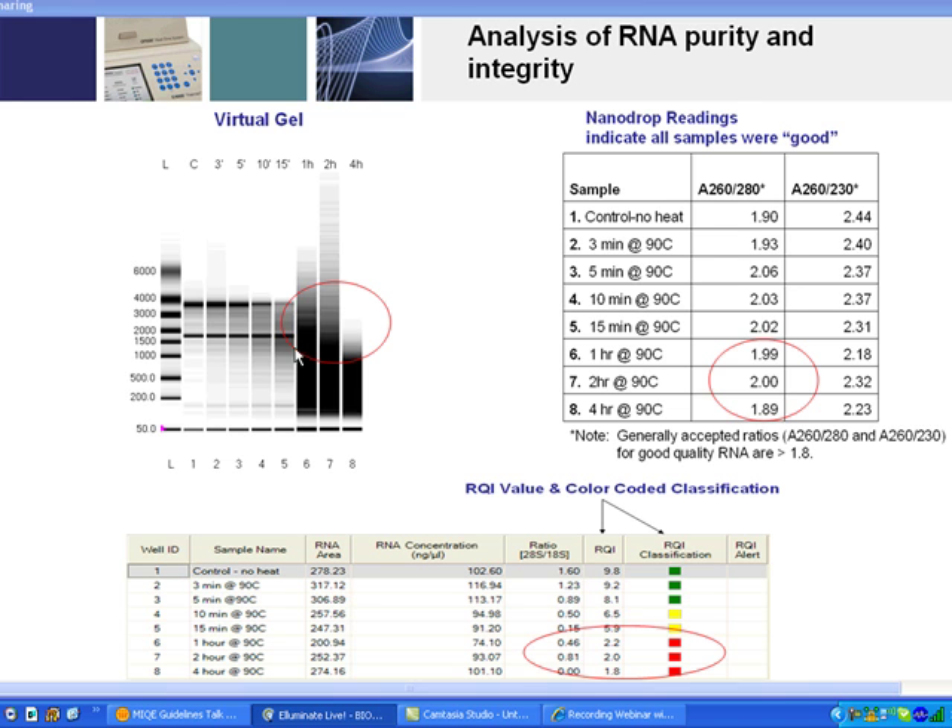However, if you look at the virtual gel image from an Experion system, which measures RNA quality — you can also use a denaturing agarose gel — you look for the 28S and 18S bands. The 28S band should be at least equivalent to the 18S band for tissue samples, and greater than the 18S band for cell extractions. As RNA degrades, the 28S band gradually decreases until it disappears, while the 18S band persists a little longer until you get massive degradation.